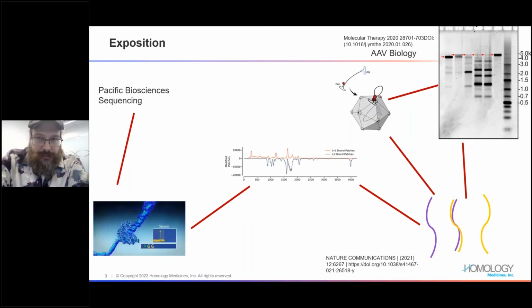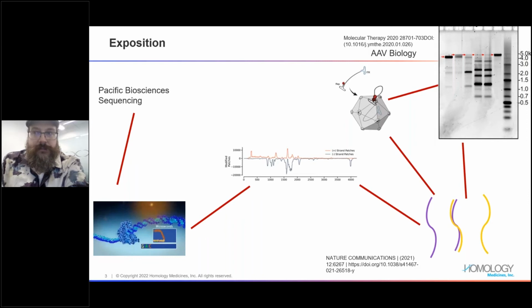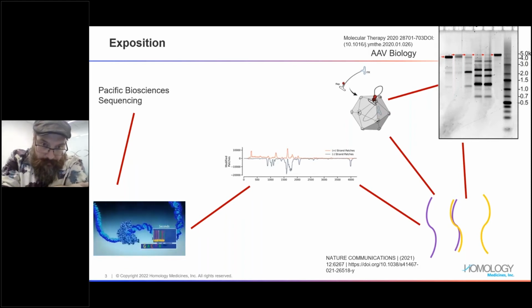And conceptually, you really don't know where they're breaking and why they're breaking. In the lower part, the idea is you break your capsids open, and through the miracle of hydrogen bonding, where you've got your positive and negative strands, you can marry that with PacBio's ability to see modifications in your bases. You get essentially what we've got in the middle, which is us mapping where our strands have been breaking. And so we can now target what areas of our recombinant AAV we need to go back and redesign, which obviously really enhances our design process.